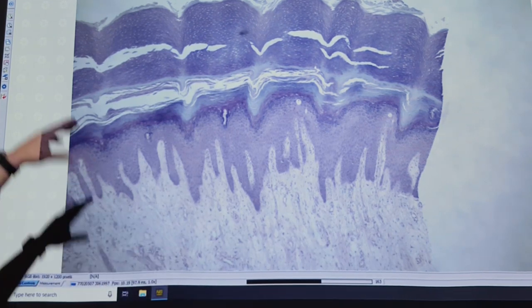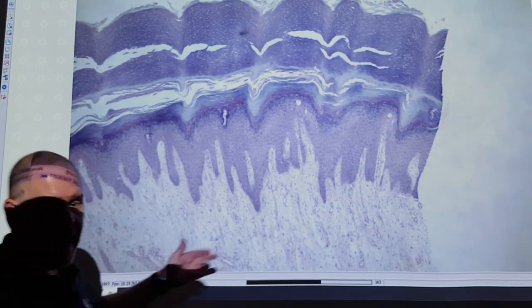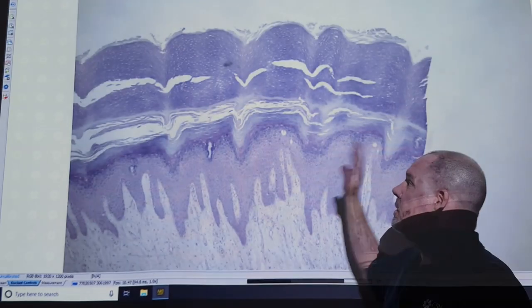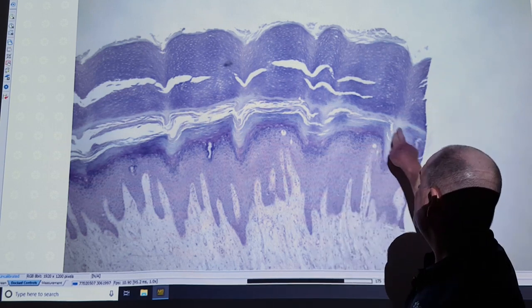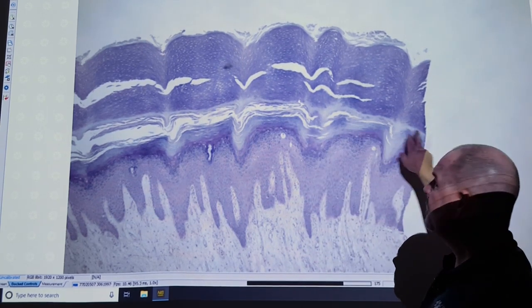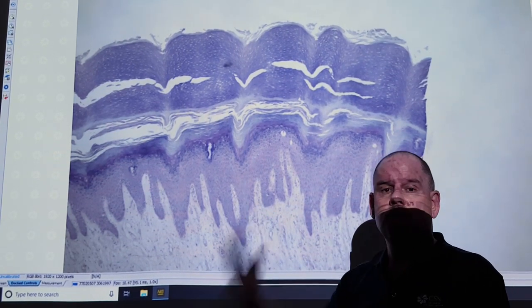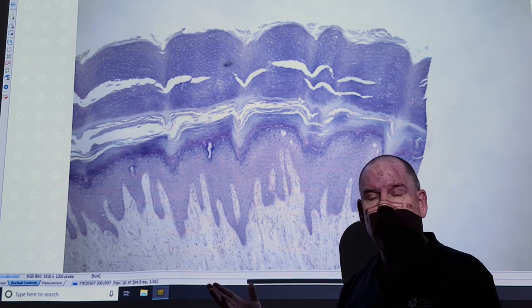We don't have any hypodermis on this particular slide, which will be visible as a bunch of adipose. Take a look. They just cut the tissue off here, so I'll find you one that shows me some hypodermis. This happens to be skin of the fingertip. I know that because I see this relatively clear looking layer right here called the stratum lucidum, which we have on our fingertips, toes, soles of our feet, palms of our hands. You'll learn all about that in lecture, thick skin.